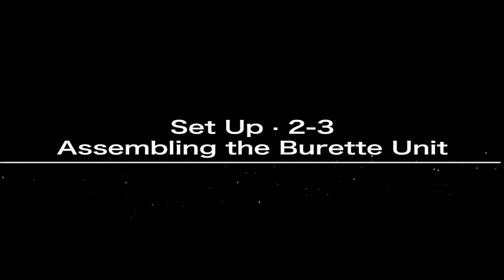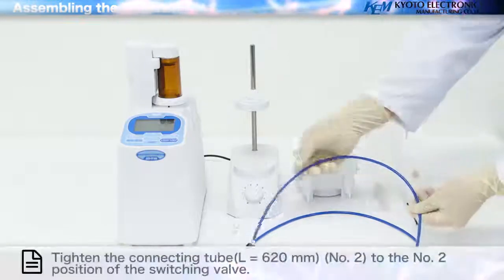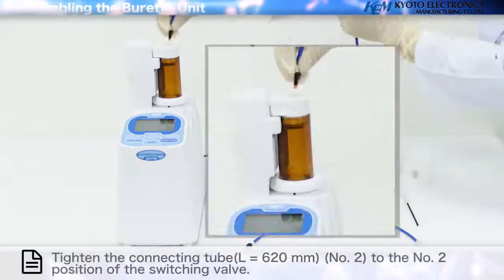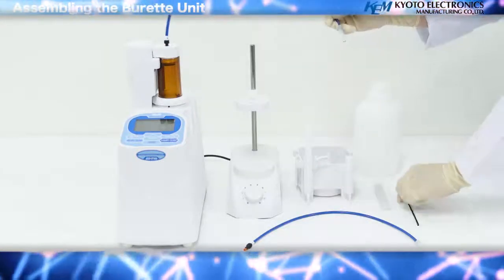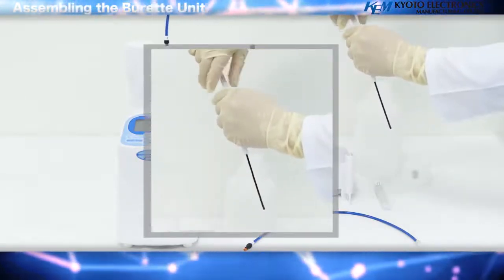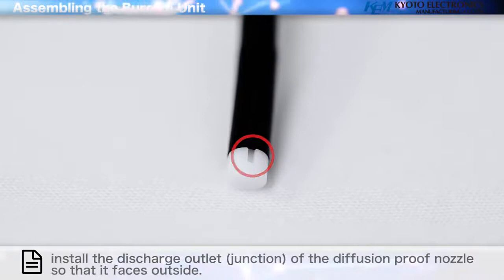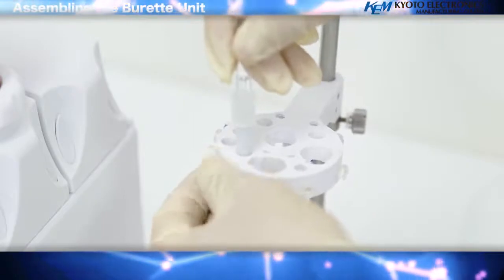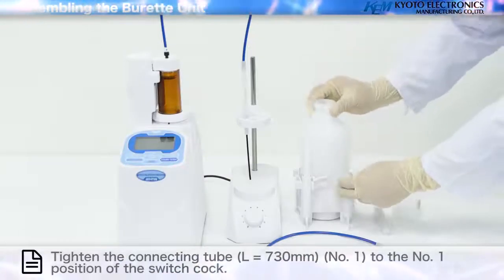Assembling the Buret Unit tubing: install the nozzle pocket to the base of the bottle. Tighten the connecting tube to the number two position of the switching valve. Tighten the diffusion proof nozzle to the tip on the reverse side of the connecting tube and attach it to the electrode holder. Install the discharge outlet junction of the diffusion proof nozzle so that it faces outside. Tighten the lid of the reagent bottle and place it on the bottle stand.